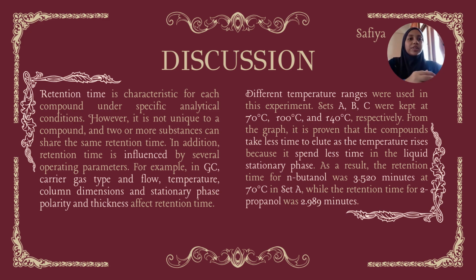So now we are going into the discussion part. In this experiment, we can clearly see that the focus is the retention time. So what is retention time? Retention time is characteristic for each compound under specific analytical conditions. However, it is not unique to a compound, and two or more substances can share the same retention time.